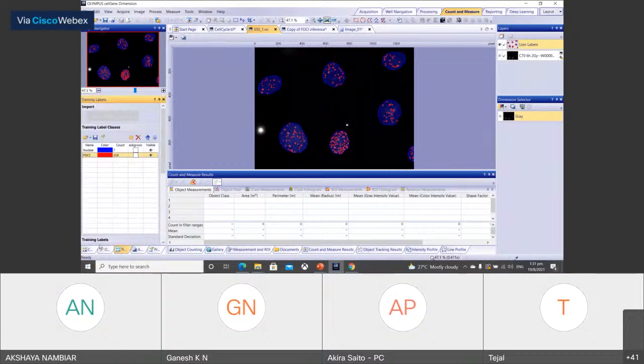In our software, this is an optional function, by the way, so it is not available for all of these dimensions. You need to have the neural network deep learning solution, and if you have that optional solution, then you can find this training label window.